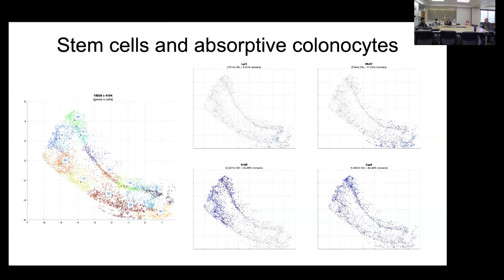Yeah, that's one reason why I started with this particular data set. It's simpler. Well, you have to figure out, can we show a control? Would that be just any mouse that we use Flex on, so we could say, here is a map from a normal colon?